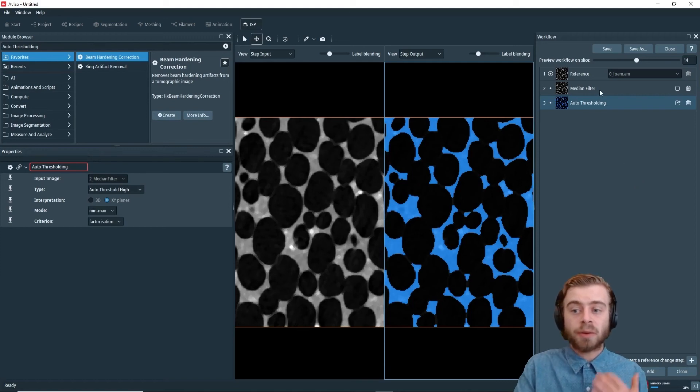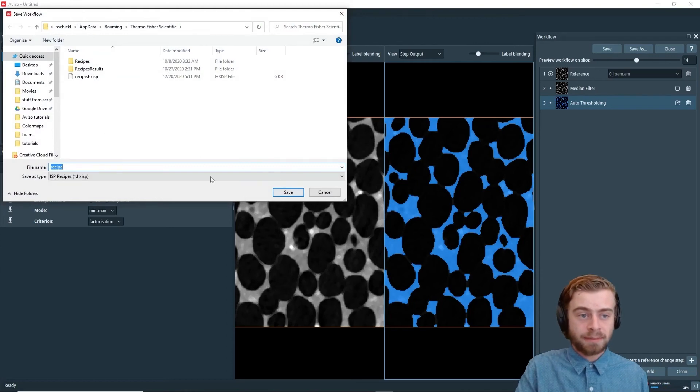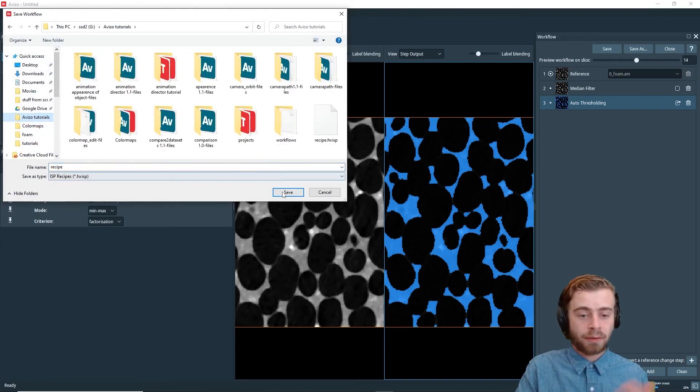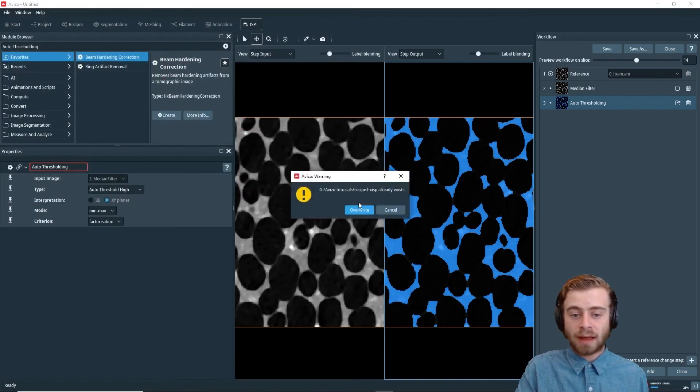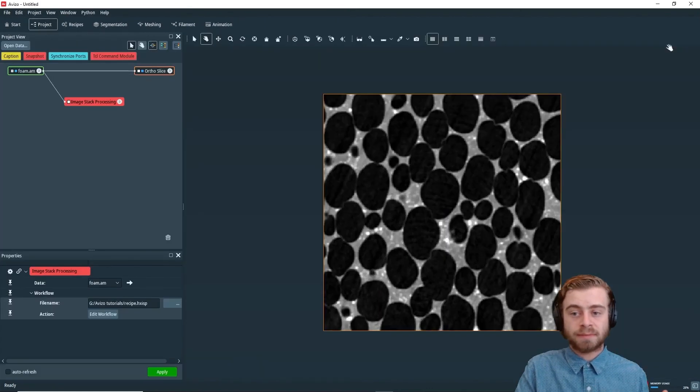All right, so we want to save this workflow. And I'm just going to save it as recipe in a folder. And I'm going to click close.